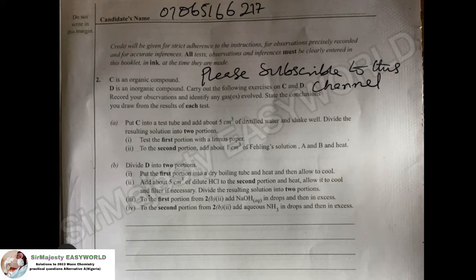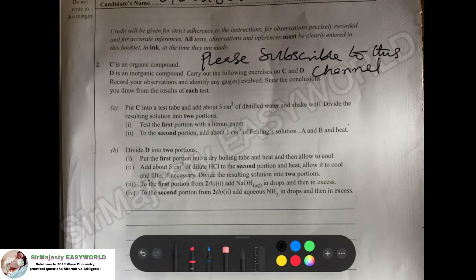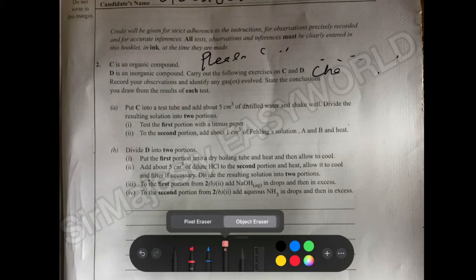So let's focus on the salt analysis now. The salt analysis is all about telling us whether it is organic or inorganic, looking at the information there. So I have to get rid of this so that we can focus clearly.